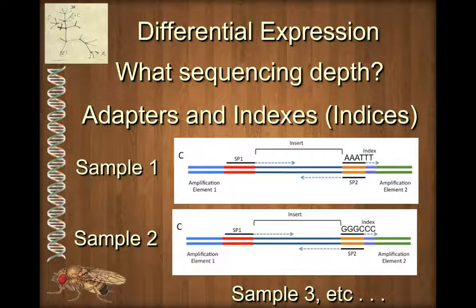And then the second one is almost certainly new. It's very unlikely that in a genome of like 3.2 billion base pairs, like the human genome, your first two sequences by chance would overlap. And so we continue to do that, and we do hundreds of billions of reads for a genome. So for instance, if we had a genome of 3.2 billion base pairs like the human genome, we'd want to do about 150 billion base pair reads altogether.